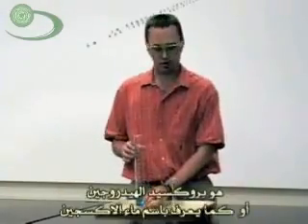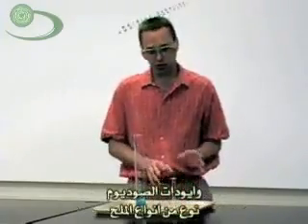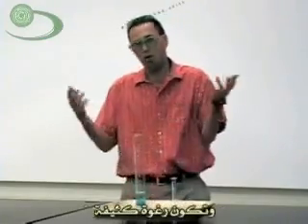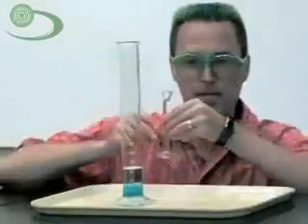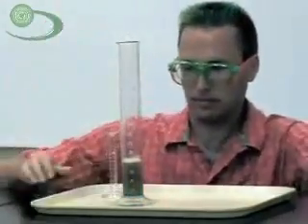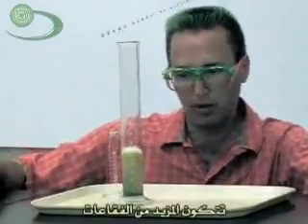What I have here is some hydrogen peroxide and some sodium iodide, which is kind of a salt kind of thing. Mix the two, and this should create a lot of bubbles of oxygen over here, and it'll foam up and be all really cool and exciting and be wicked fast. All right? Ready? Here goes nothing. Oh yeah, look, there it is. It's bubbling. Ooh, bubbling away.